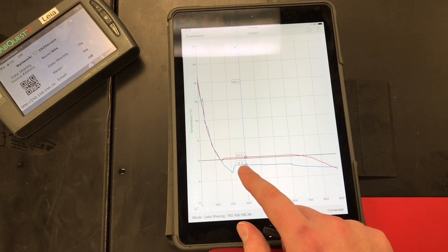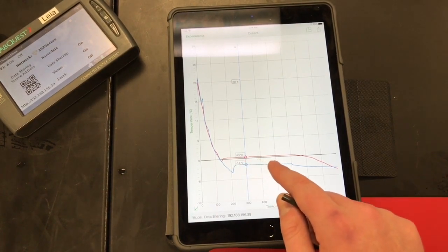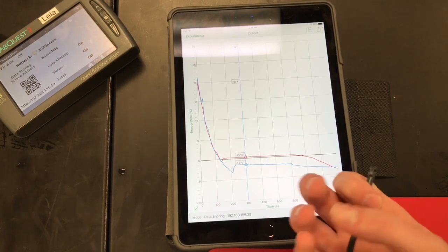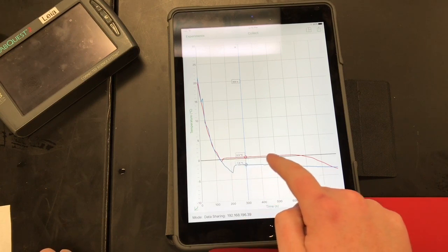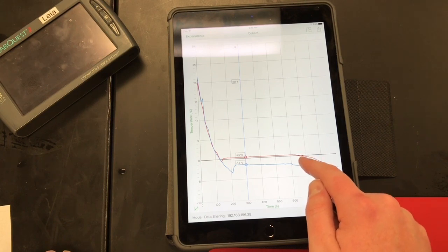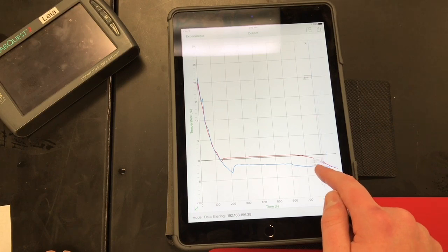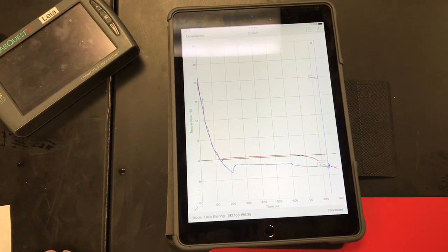The reason that it's not totally stable in the salt water is because as the fresh water within the salt water is freezing, the water becomes more and more salty. Over time, the salt water is becoming incredibly salty as all of the fresh water, the stuff that's not salty, freezes out. So again, while this is stable here, it's undergoing a phase change. When that phase change is complete, that would be right here. That's when your fresh water can start cooling down below its actual freezing point, because all of the water has turned to solid ice, and the ice can go well below the freezing point.